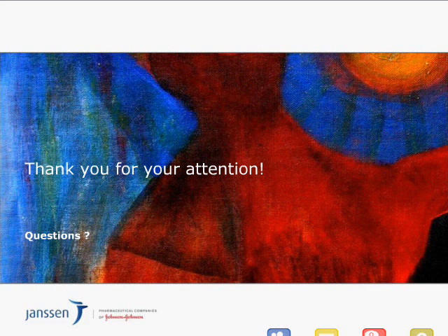Do you use Library Studio to design experiments? Yes, we do the design of experiments every time in Library Studio for all our screening work. Okay. Do you use statistical software?